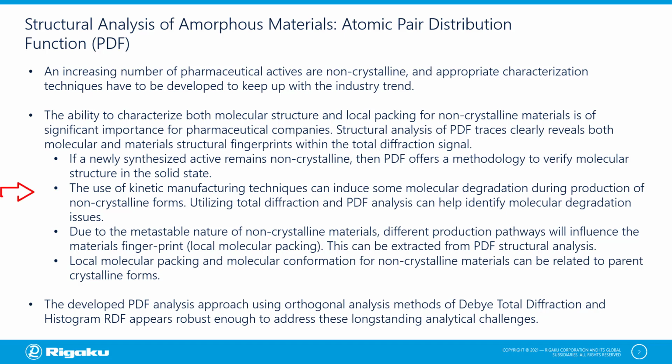The use of kinetic manufacturing techniques can induce some molecular degradation during production of the non-crystalline forms. Utilizing total diffraction and PDF analysis can help identify this degradation in the early stages before it becomes an issue downstream.